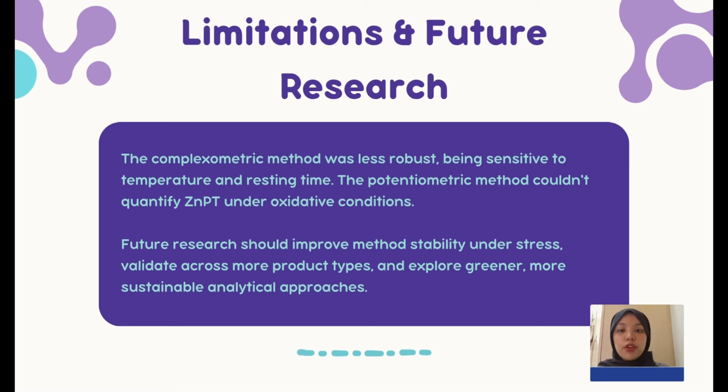While our study provides valuable insights, it is not without limitation. One limitation is that both methods were validated under controlled laboratory conditions. They may not fully reflect the variability in real-world manufacturing environments. Additionally, the methods were optimized for rinse-off shampoo products and may require further adjustment for other cosmetic formulations.